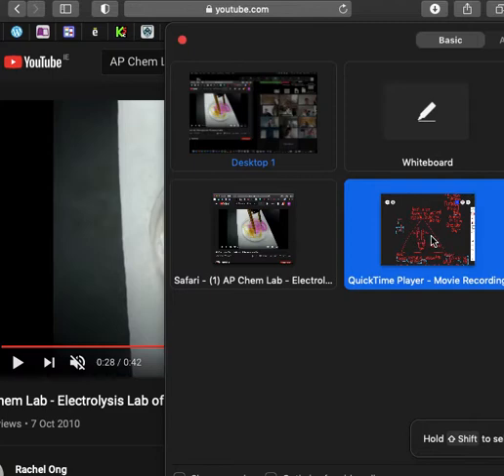Okay, so in this one, the good part is you get to see the colors, and that can help you figure out your products. In terms of our electrodes here, they can be anything. They could be platinum or they could be carbon, so you can actually do it with the pencil leads.